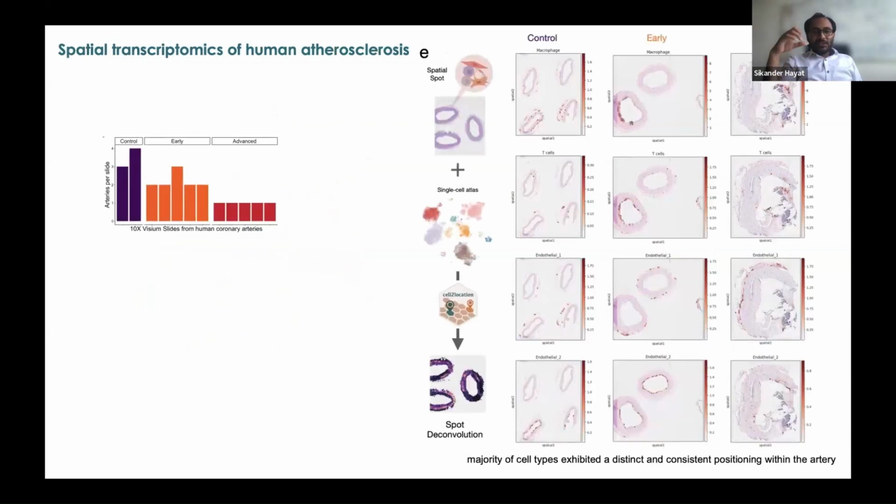Then we wanted to leverage the spatial transcriptomics, and this is probably the new data that hopefully will be a bit more exciting for you. We took the data from the 14 spatial transcriptomics samples that we had. We did spot deconvolution. Spot deconvolution is relevant when you are working with, let's say, 10x Visium, because 10x Visium spots are 55 micrometers, and there you really need deconvolution, because each spot can have more than one cell present in that region.